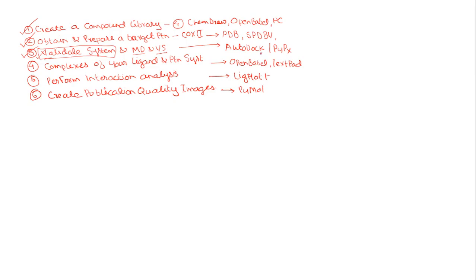So today we are going to discuss interaction analysis. How do we perform interaction analysis of the protein-ligand complexes that we might have obtained in our previous step of molecular docking and virtual screening.